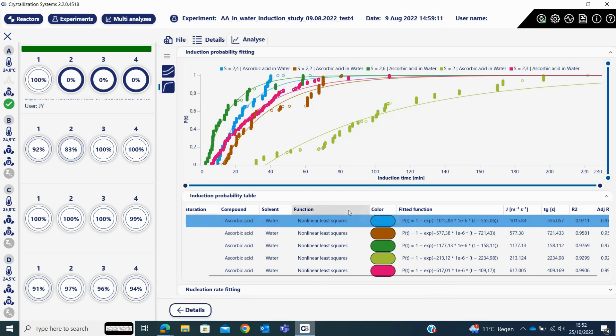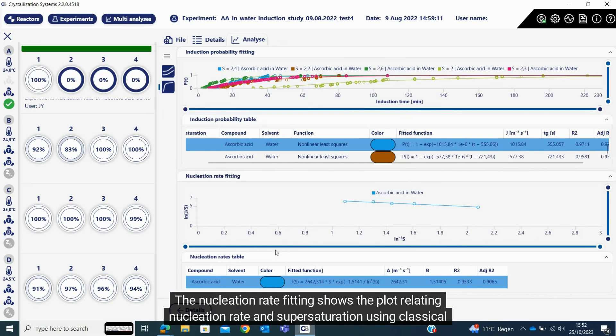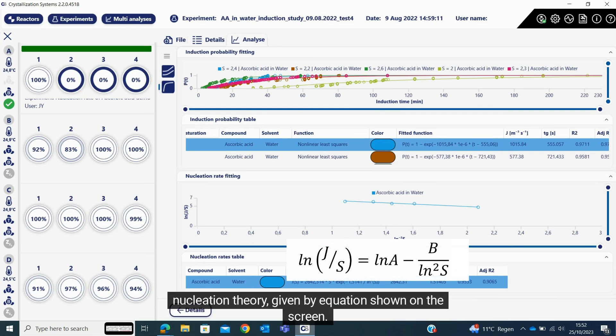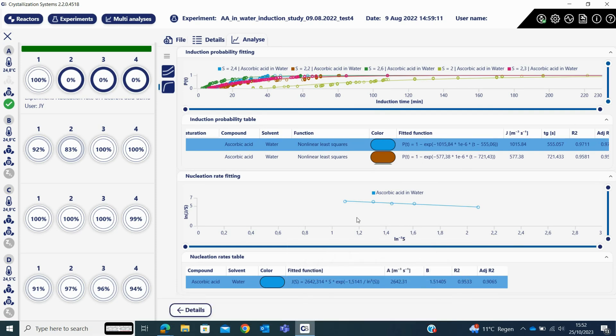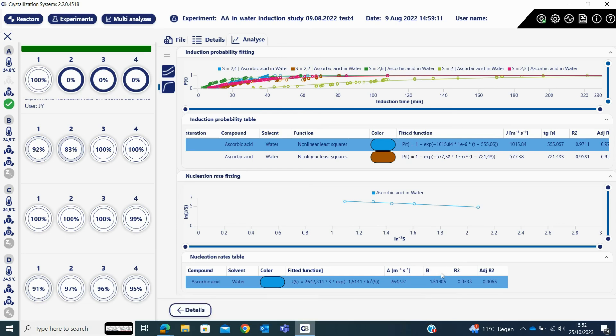The nucleation rate fitting shows the plot relating nucleation rate and supersaturation using classical nucleation theory given by equation shown on the screen. From the plot by curve fitting, the nucleation kinetic parameter A and thermodynamic parameter B are determined.